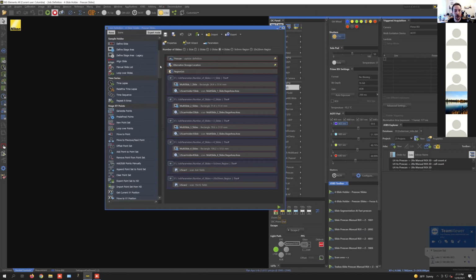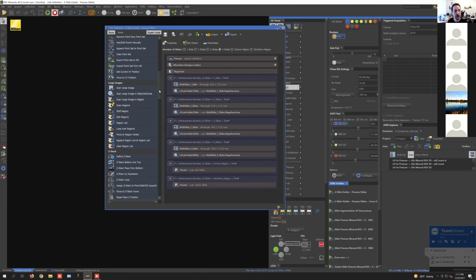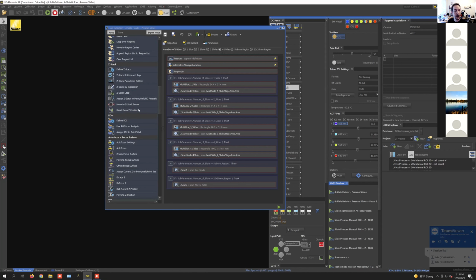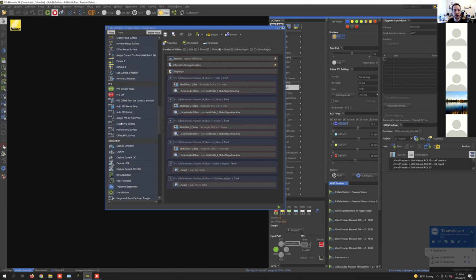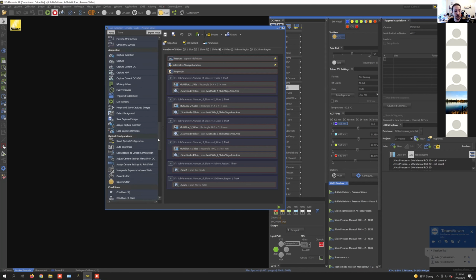Things for time-lapse imaging, to deal with multi-points, which we can use to build up 3D montages and things like that. Large images to deal with imaging tissue, all the stuff with Z-stacks, ROIs, autofocusing, Perfect Focus, which we also have, which helps to lock onto the cover slip. So if you're doing live imaging and you don't want to have issues with drifting, this is something we can also control through Jobs. A lot of things with acquisition.